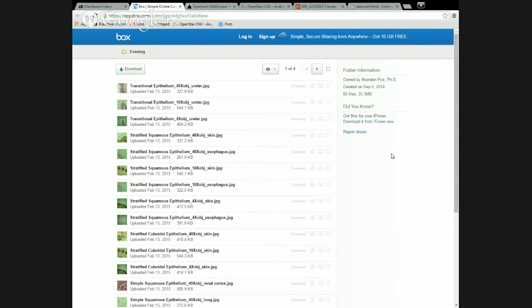You're going to be assigned one of those tissues, and your job is to find it under the microscope and get pictures of it captured with the digital scope up here. That's what we're going to be doing with the rest of today, and if you don't get it done today, on Wednesday we'll continue with that. Hopefully on Wednesday we'll be completely done with all the tissues by about the midway point, and we can start talking about the skin and the skeleton, so we don't have to cram that all into next Monday's class, but we'll see how it works out.